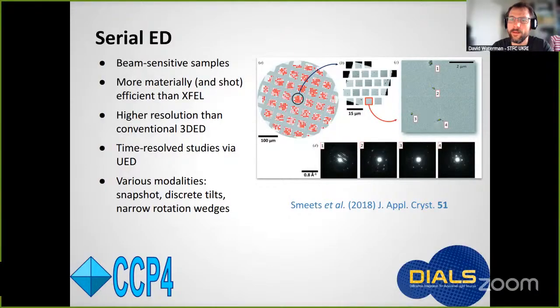But serial ED is really advantageous when the amount of material is limited. So rather than spraying it all over the place with an injector system, which is a bit rude because these are highly advanced pieces of equipment, but they're very wasteful of the sample in the XFEL, on a microscope you can collect all of the nanocrystals laid out on a grid quite nicely.